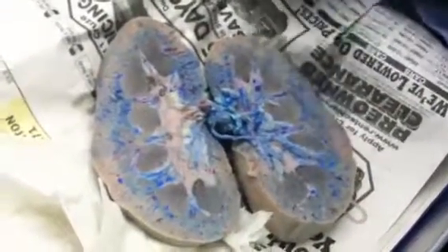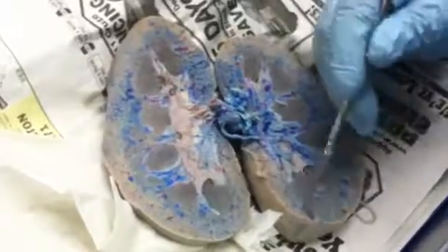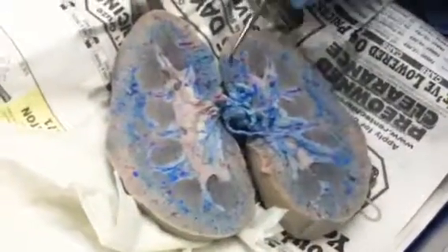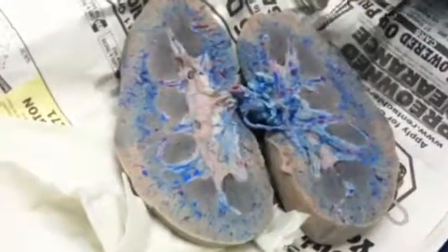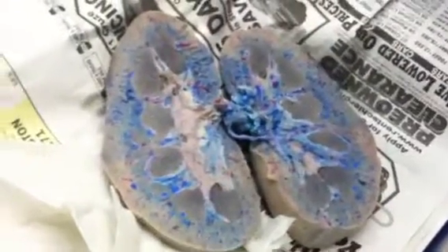Can you go over again that 80% of the nephrons start in the cortex? That's why, when we saw it on the screen, you saw all those renal corpuscles. They were up here, and that's why you know that's cortex, because you'll see all the renal corpuscles. Can you go over the blood vessels one more time?